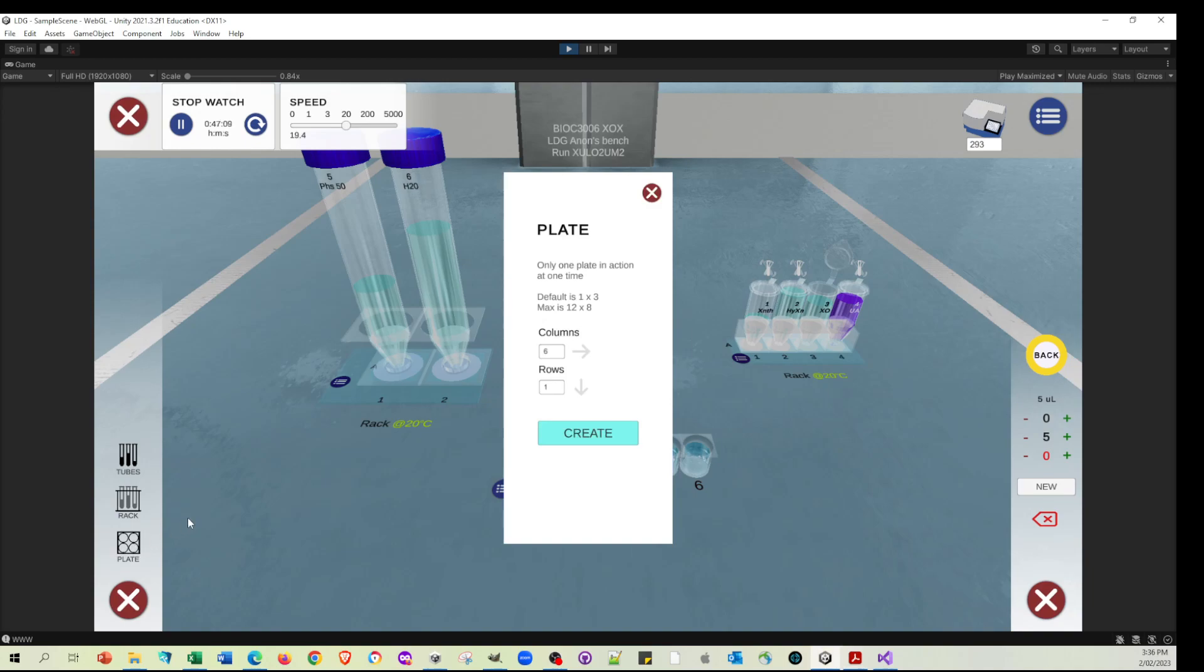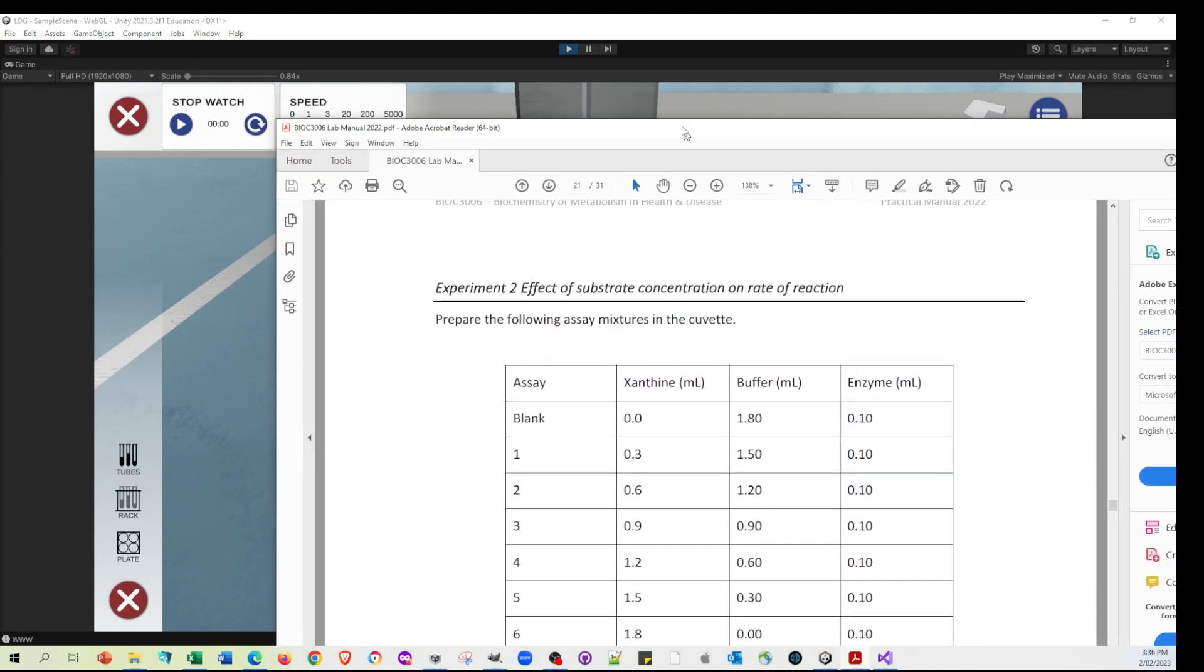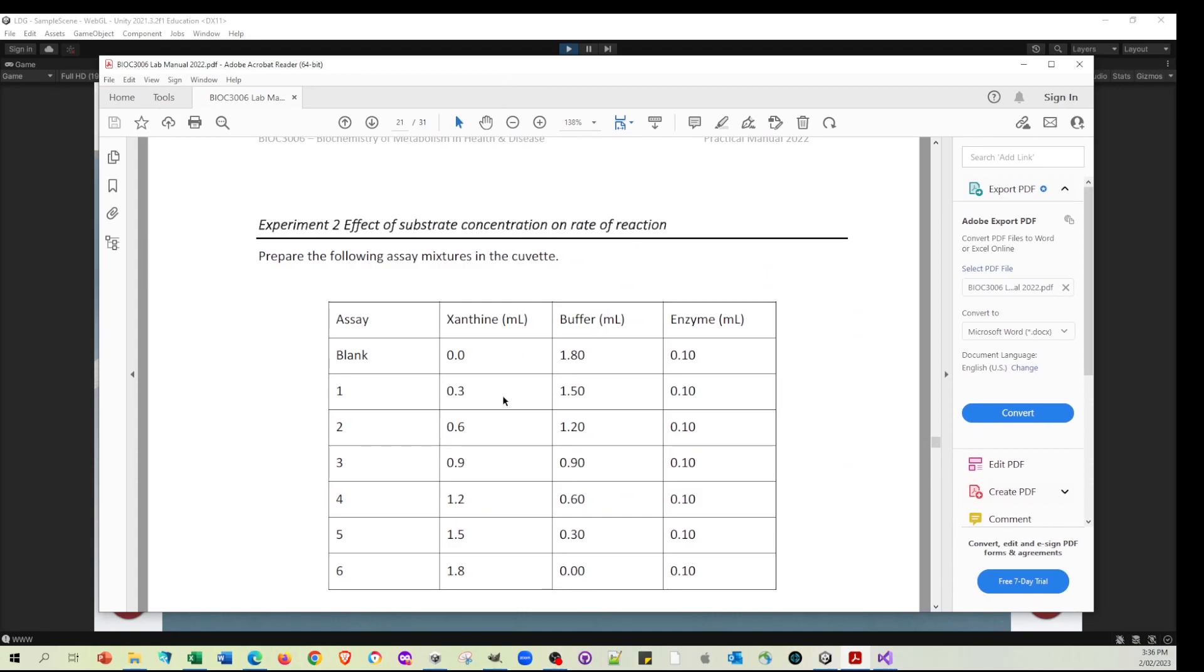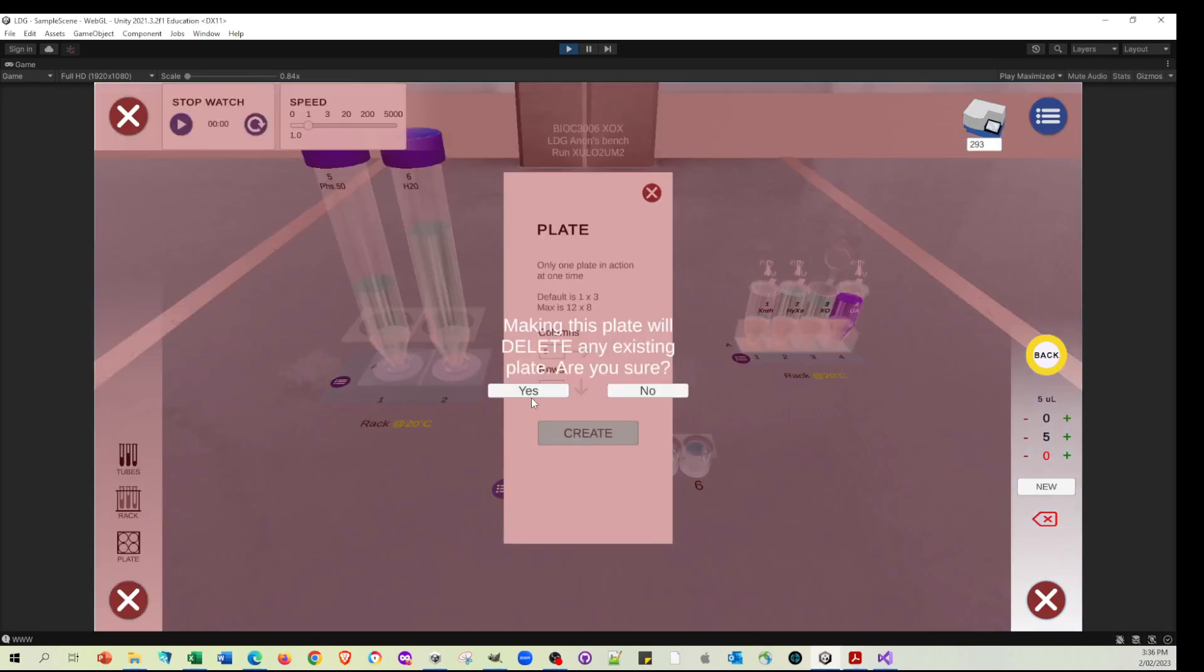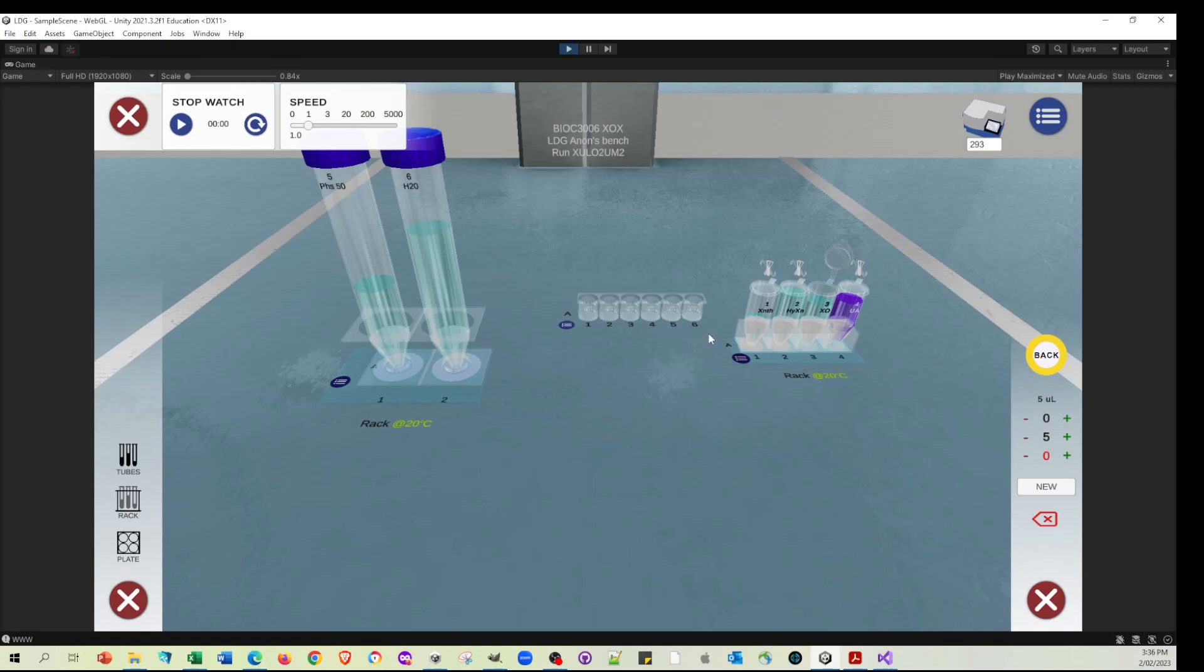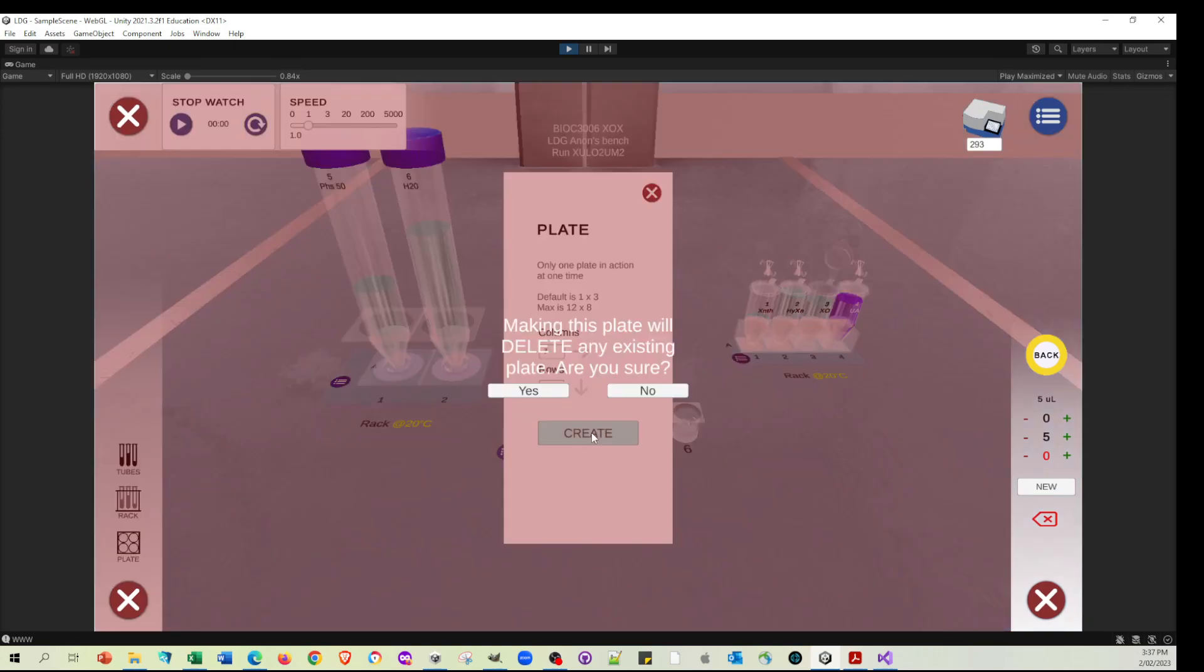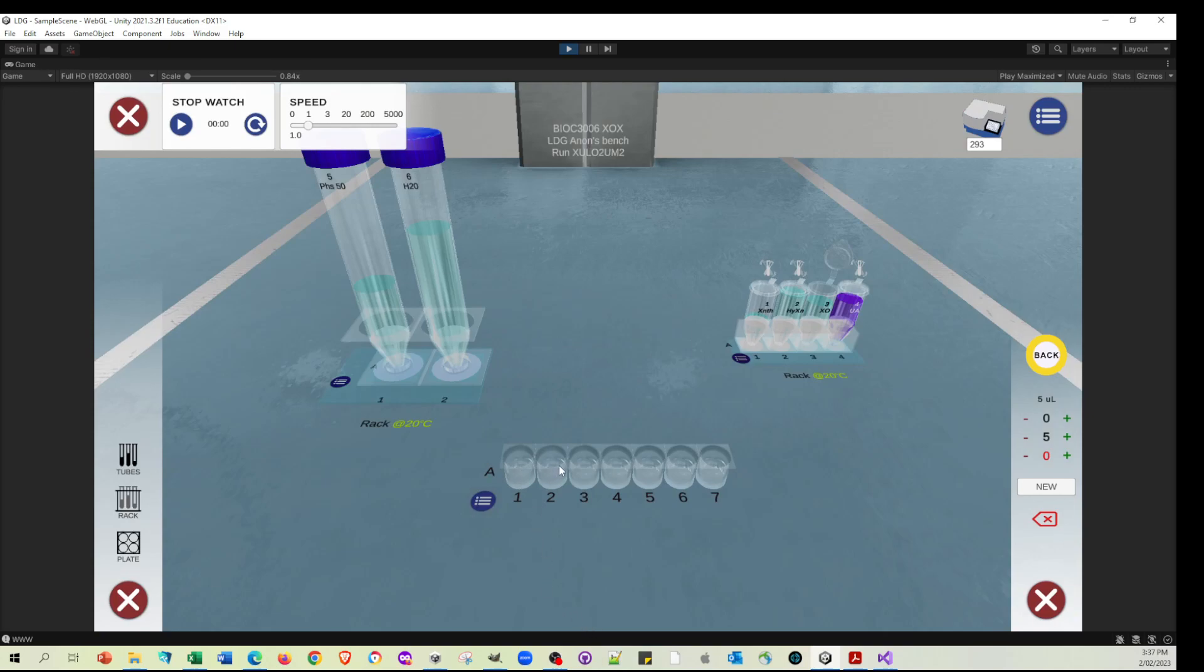Let's take the speed back down to one. Let's stop this and reset it. Let's actually do this experiment with the substrate, different substrate concentrations. So I'm going to do 30 up to 180 of xanthine, opposite of buffer, and 10 of enzyme. Let's see how well I do in that. So I'll make a new plate. And in fact, actually, I want a different plate. I want seven columns because I want the first one to be zero. So I'm going to go 0, 30, 60, 90, 120, 150, 180 of the xanthine.